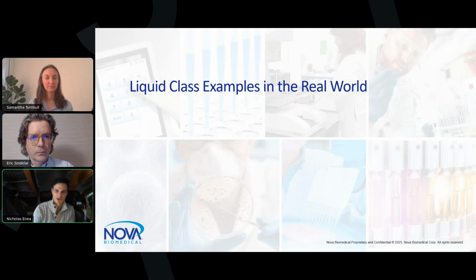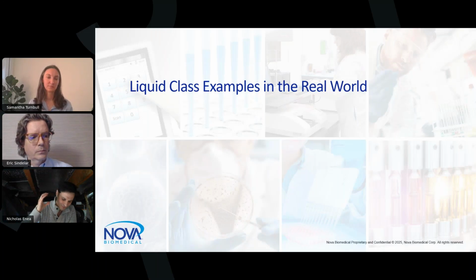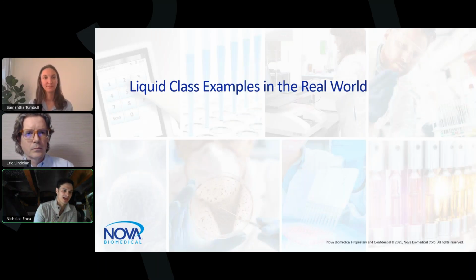And then kind of why we're all here today. It's super important, and I can't stress this enough, to optimize our liquid classes, because volume, and I think people don't realize this, as a bench scientist, I didn't realize this as well. We get so involved in the chemistry or so involved in the pneumatics of our assays that we don't think about volume. Volume is essential to anything that we do in the laboratory. If we're off with our volume, there's no shot that we're going to get close to anything that we're doing. So I just wanted to walk through a few examples just to show you why it's super important to really go over liquid class optimization in your labs and to really incorporate that as part of your processes.